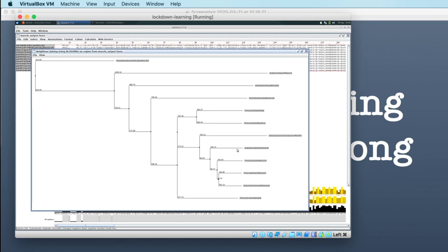As I mentioned while Conda was doing its thing earlier on, we will turn our attention to some RNA-Seq data next week. So we'll start to think about downloading some data and the tools that we need to analyse that data, and why I'm recommending the tools that I recommend as well. So I'll give a bit of an introduction to RNA-Seq analysis and why we tackle the analysis in the way that we do.